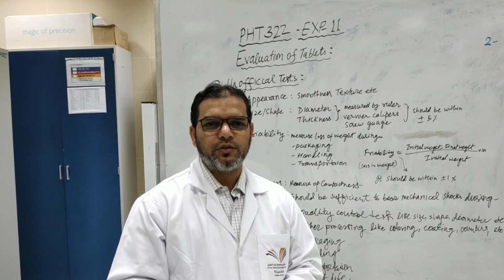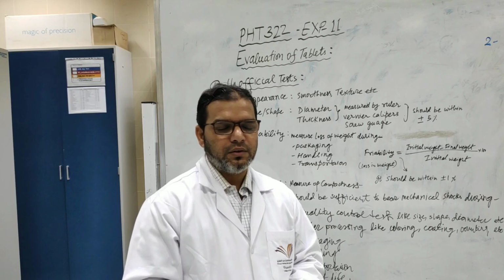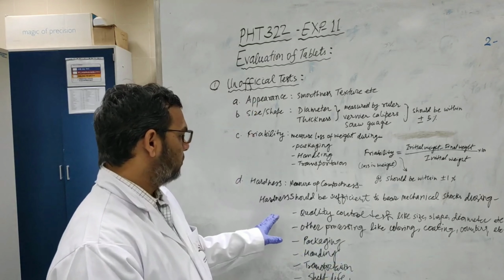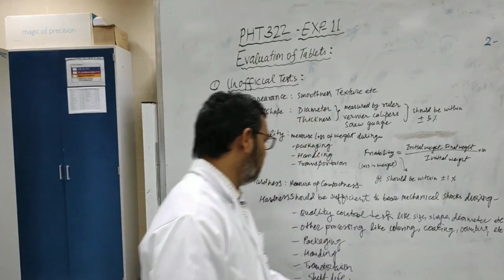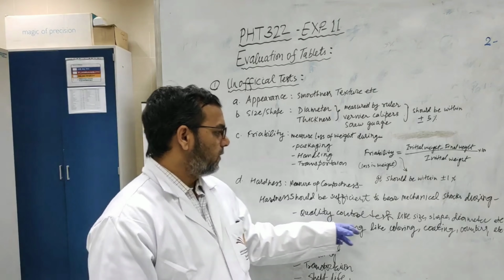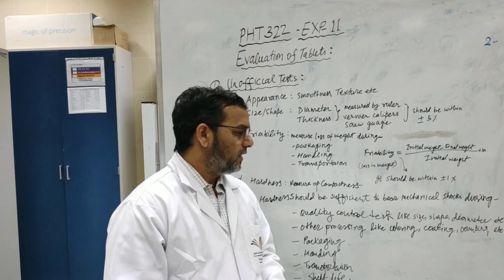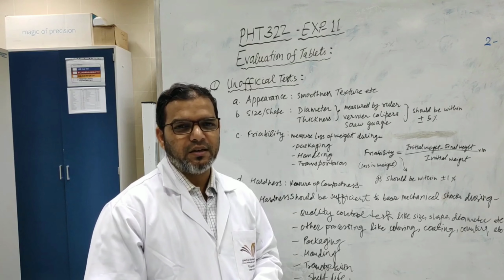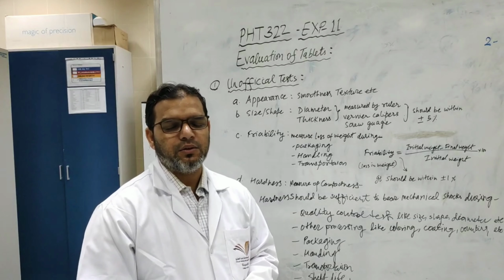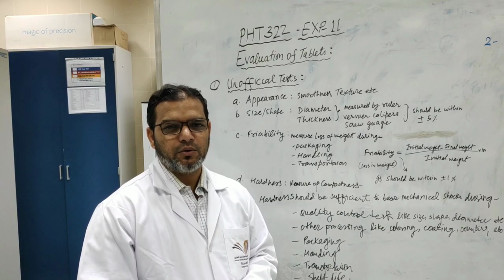So the tablet has to be hard enough to bear the mechanical shocks during quality control tests, like size, shape and diameter and counting. So during production of the tablet itself, you take the tablet for several quality control tests.